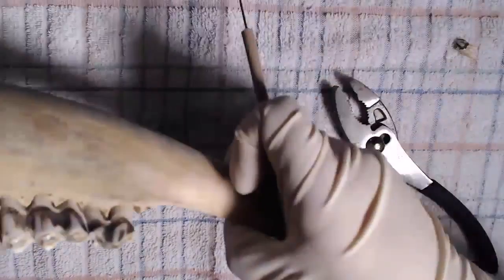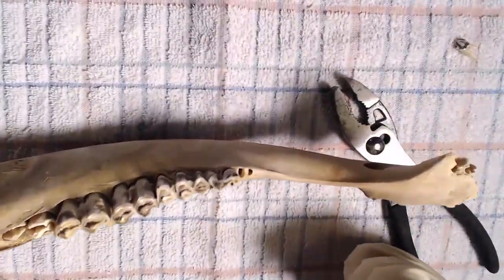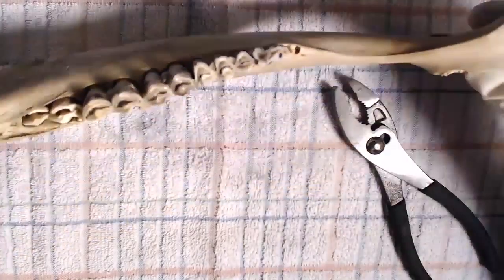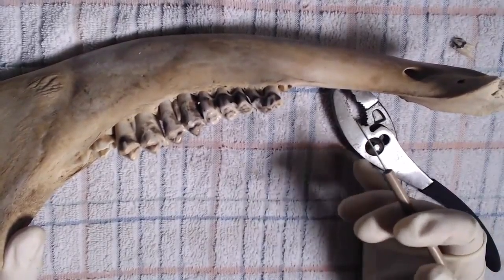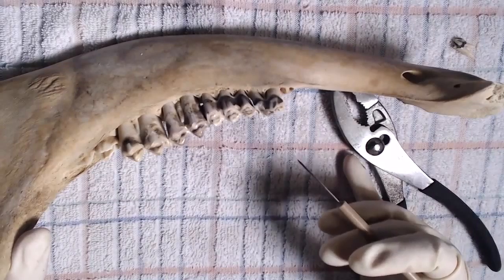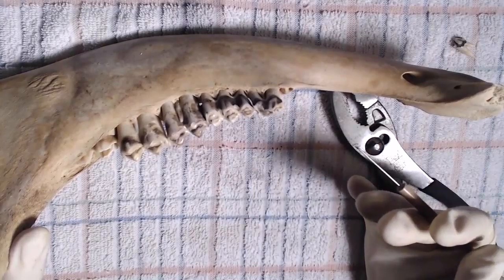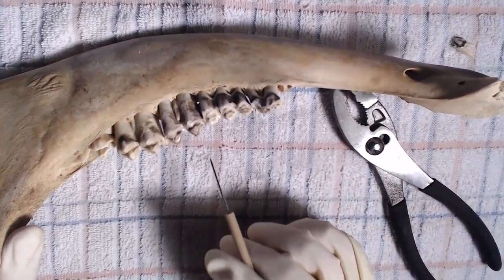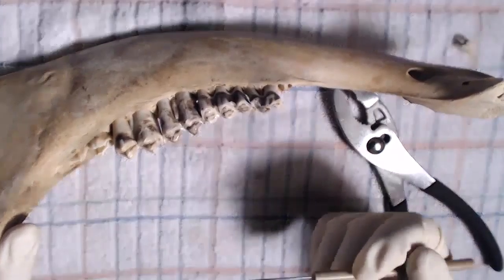Now I'm going to look at the cow jaw again. And we're going to look at the other teeth here, which are interesting because they're actually worn out quite a bit. And that's actually useful for aging the cows. So for animals like the cows and the horses, they can look at their teeth and see how worn down they are, and that kind of can indicate if they're a younger animal or if they're older. So this one is probably older because it has a lot of wearing on its teeth, which is good for us because we can identify some more layers of this tooth here.